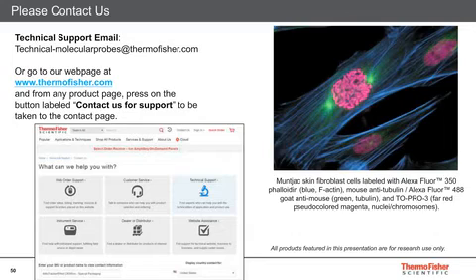Good question. Well, RPE, or R-phycoerythrin, is very common in flow cytometry because it does have a very strong quantum yield and extinction coefficient. It's a very strong intensity. However, it's not photostable, even with anti-fade mounting mediums. The photobleaching is very bad.